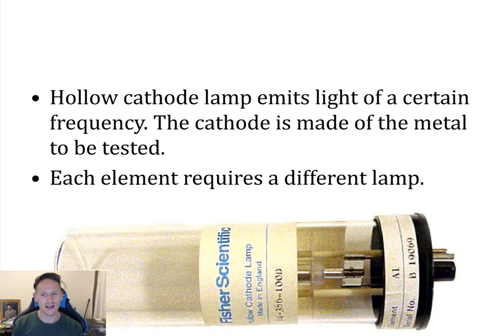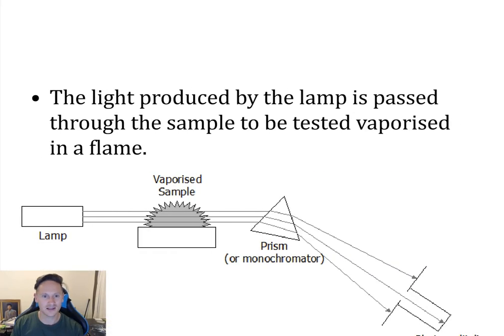So you can probably think of a downside to this technique already. If we're testing lots of different metals, we need lots of different lamps. And these lamps are actually quite expensive. So that's a downside.